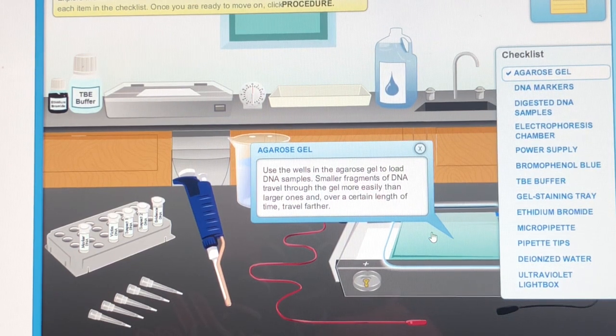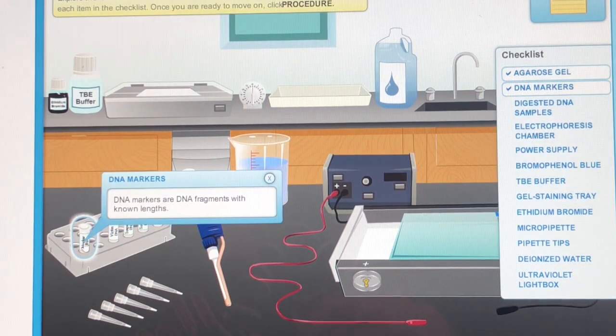Smaller fragments of DNA travel through the gel more easily than larger ones, and over a certain length of time, travel farther. DNA Markers are DNA fragments with known lengths.